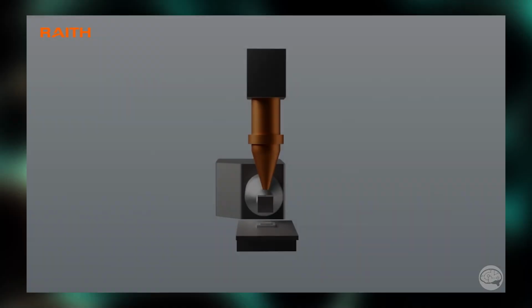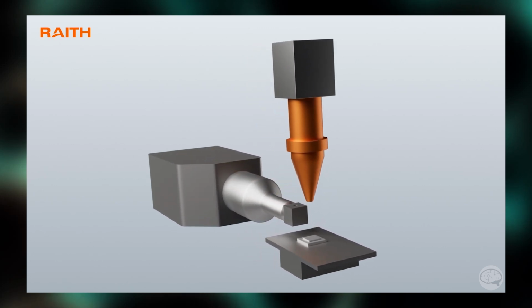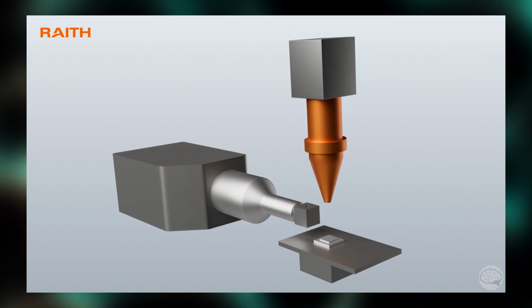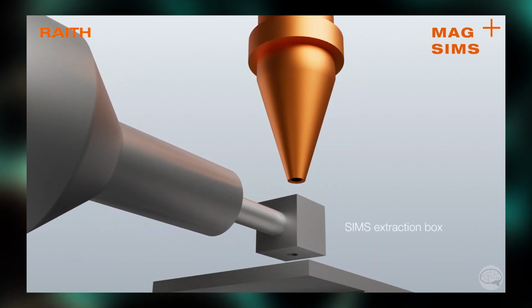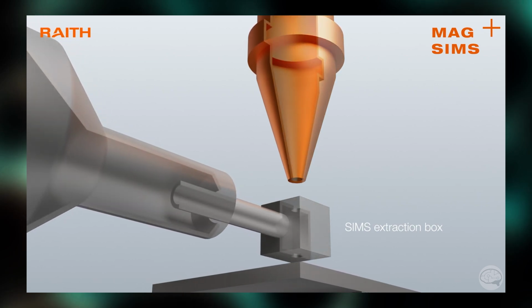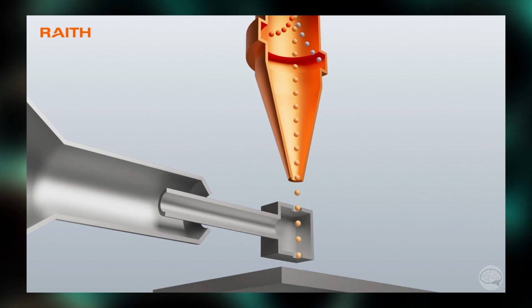So last year we were talking about this ion source technology and talked about a few use cases. This year we have merged different technology bricks and components and made a system out of it. And the system uses this liquid metal alloy ion source technology, so we call it Ion Select, and we use a magnetic sector SIMS unit for analysis on the system. So this is what we did in the last year.